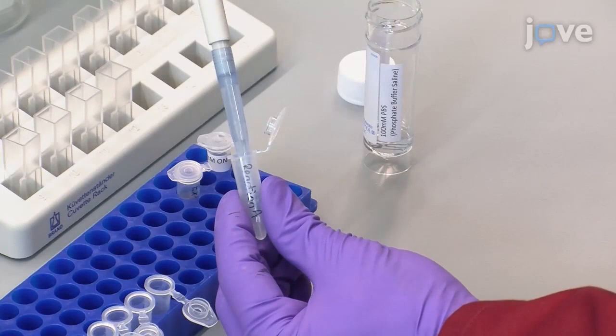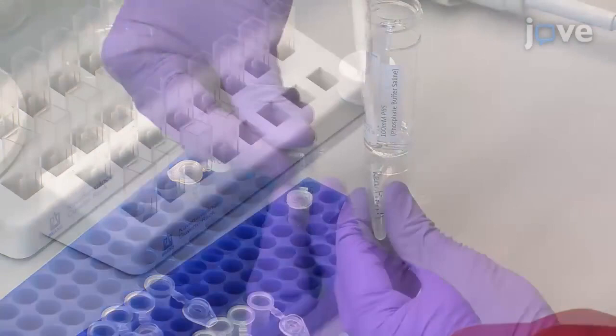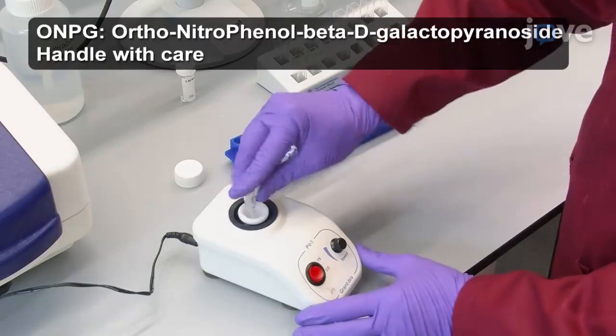Place 390 microliters of 100-millimolar PBS into a 1.5-milliliter tube labeled Reaction A. Then, add 100 microliters of 5-millimolar ONPG solution and mix well by vortexing. Add 10 microliters of extract into the reaction A tube and vortex the contents.